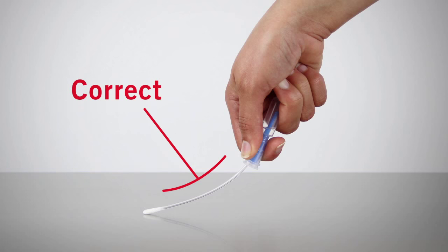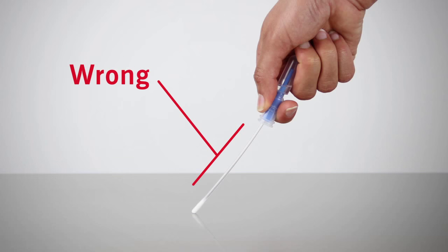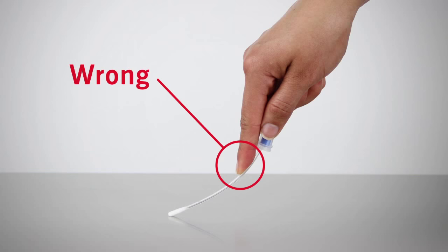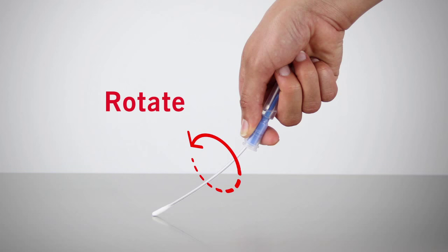Apply sufficient pressure to maximize sample collection and improve the accuracy of test results. Be sure not to touch the swab shaft when collecting sample, as this could contaminate the test and cause inaccurate results. Rotate the swab tip while swabbing to ensure maximum sample collection.